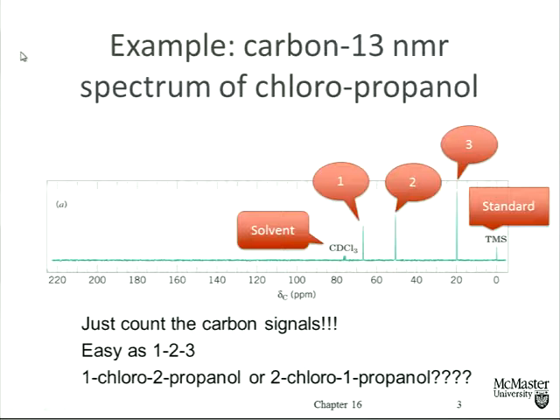We have an x-axis, which has the weird symbol delta C on it. This is a delta that is not like the delta plus, partial plus, or delta minus that we are now getting used to. This is the axis that's called chemical shift, and we'll explain what that means in a bit. It's unitless. It's measured in parts per million. Okay, we'll see why that is.